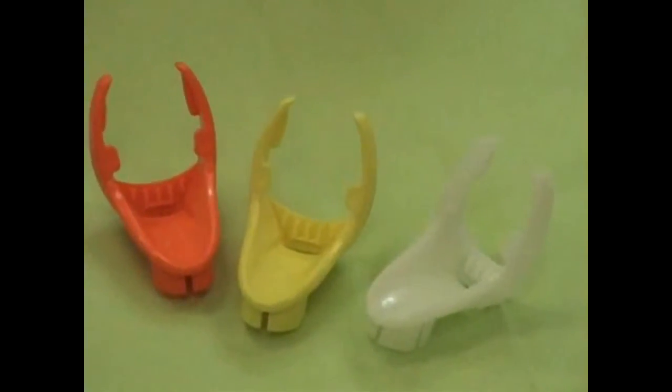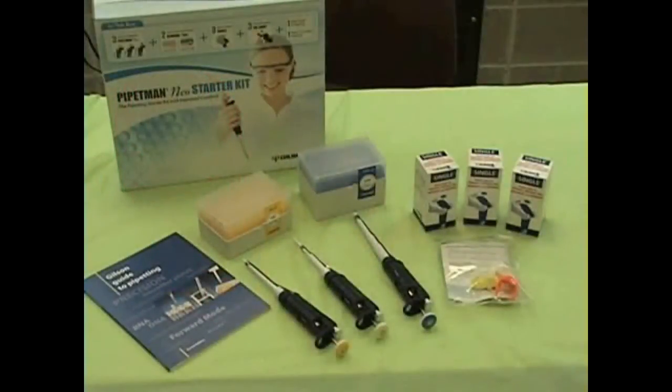Also included are three Jemmie Microtube Openers, three single pipette holders, a two-minute pipette inspection chart, and a Gilson guide to pipetting.